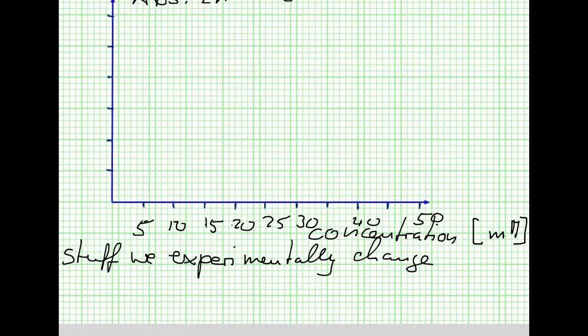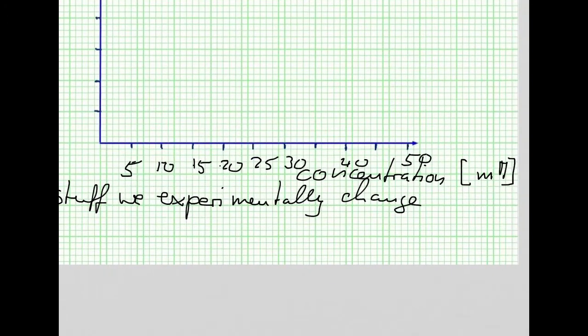And a good graph design, that's quite important. What I sometimes see is people having this massive graph paper, and they draw the graph here. And I go, wow, I go blind.